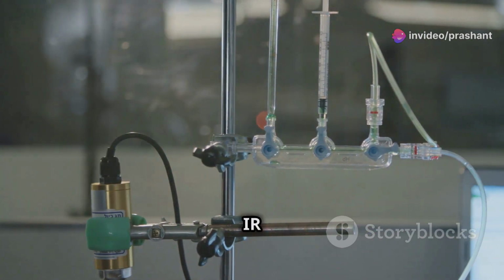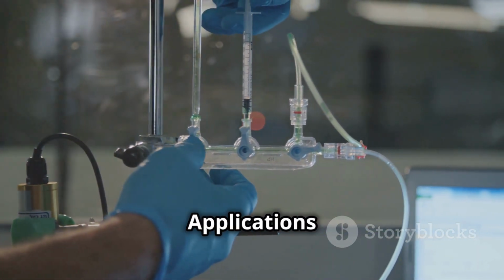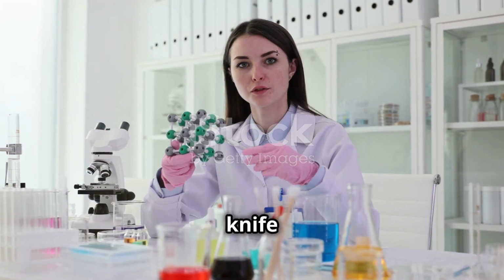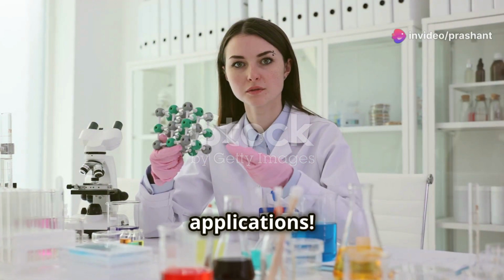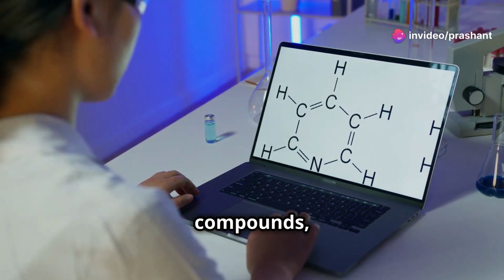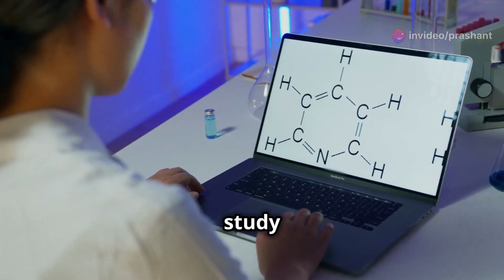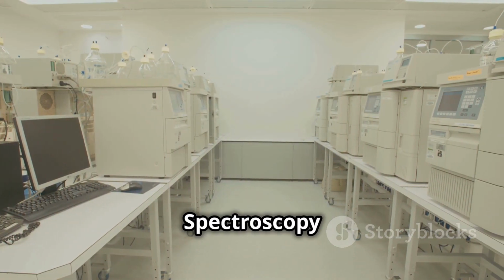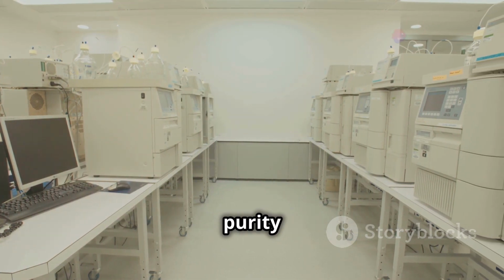Section 6. IR Spectroscopy in Action: Applications Across Industries. IR spectroscopy is like a Swiss Army knife for scientists. It has tons of applications. In chemistry, it's used to identify unknown compounds, analyze reaction mixtures, and study molecular structures. The pharmaceutical industry relies on IR spectroscopy to ensure the quality and purity of drugs.